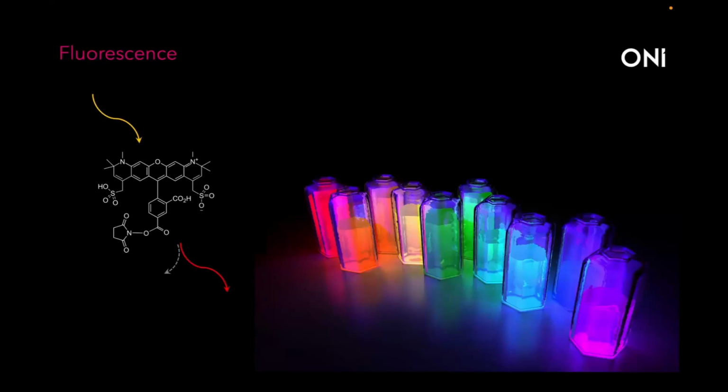And because it's lost some energy, its wavelength will be longer, because shorter wavelengths of light have higher energy. So what this means is if you shine a particular wavelength of light onto a sample, most of the molecules in that sample will re-emit the light at essentially the same wavelength, whereas just the molecules you're interested in will do it at a different wavelength. If you can then discriminate those using a microscope and the relevant fluorescent filters, it means you have fantastic contrast where you literally only see the molecules that you're interested in.